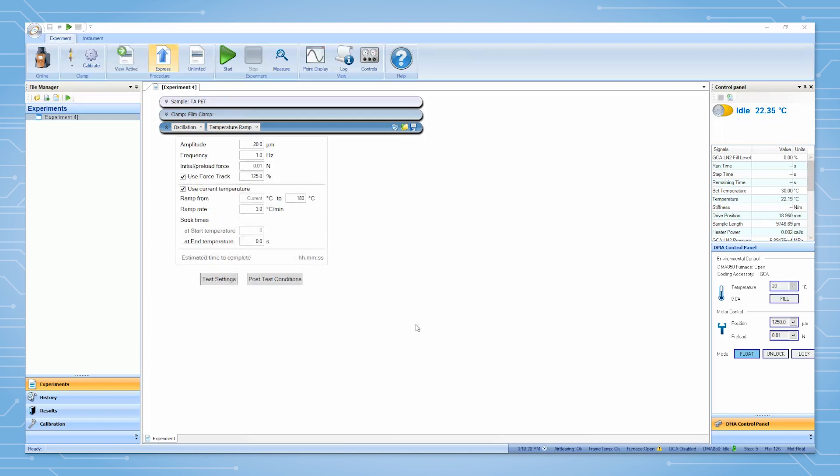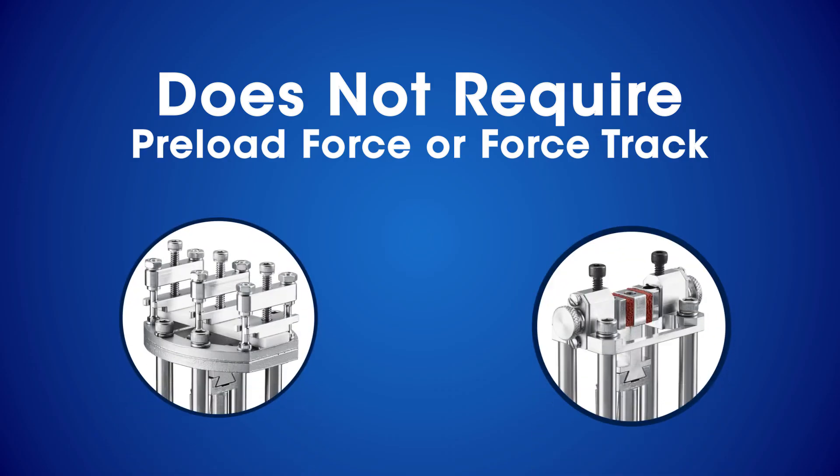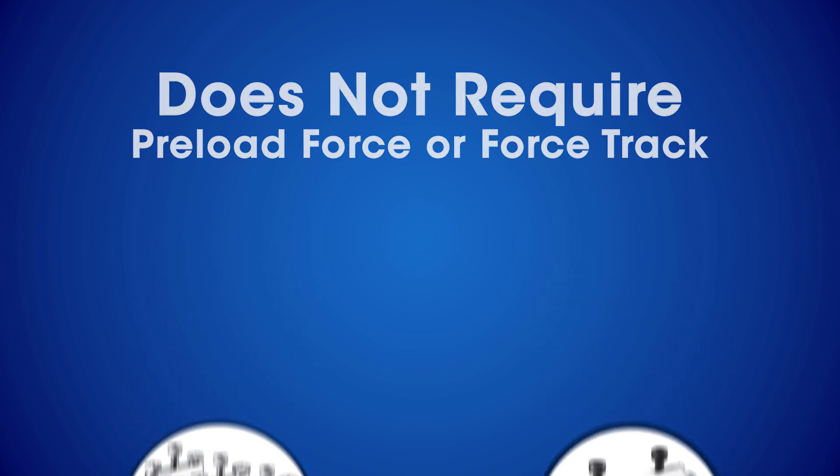For some clamps there are initial or preload force and force track options. These options are necessary to obtain correct results with certain clamp types. When one of these clamps is selected as the active geometry, these options will appear here. The cantilever and shear sandwich clamps do not require a preload force and force track.